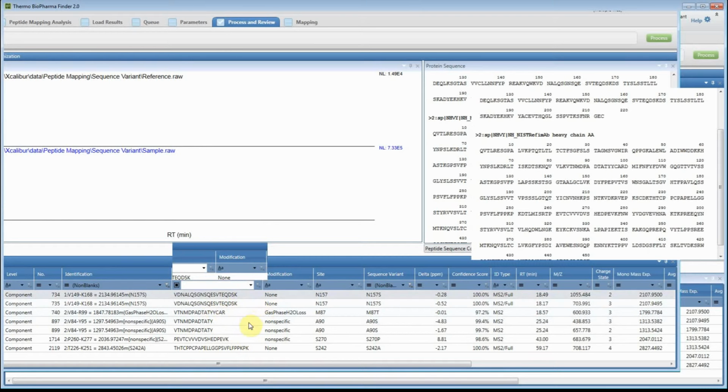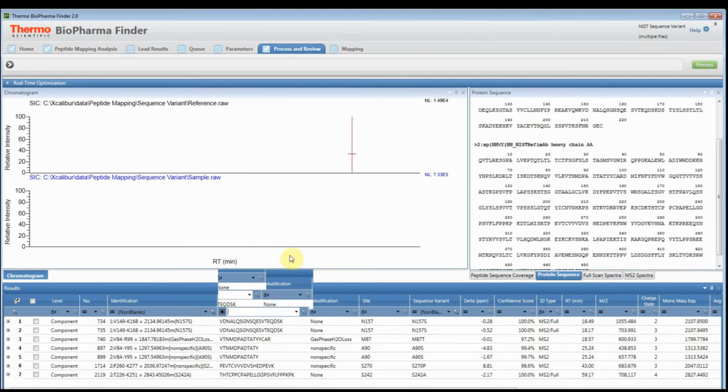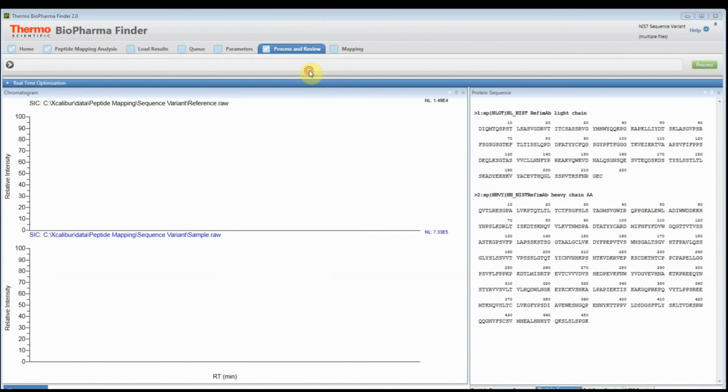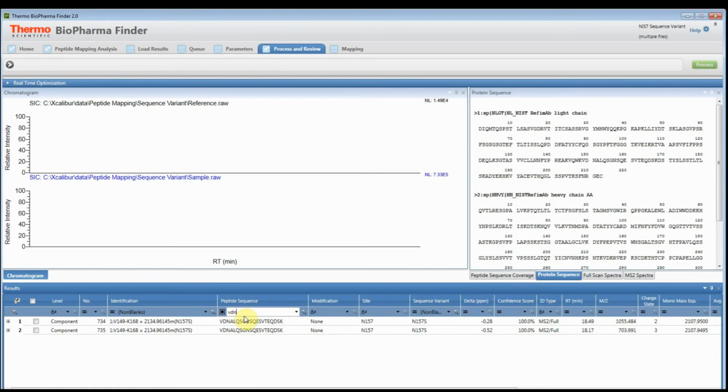It takes just a second here for my computer screen to come back. Just not too sure why it's doing that. There we go. Just pop that out there. That gets it back in. Okay. So let me go ahead, and there's something with my memory going on here.